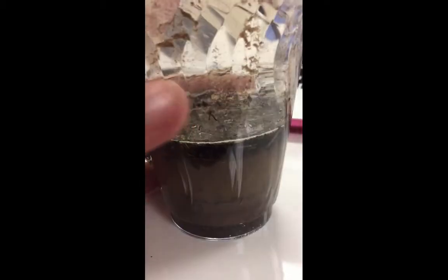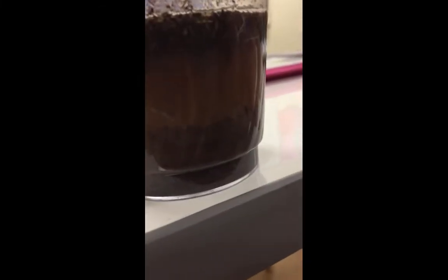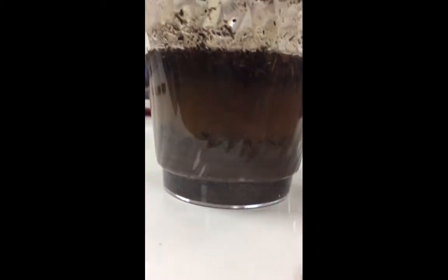The next thing we're going to do is measure the height of each layer within our cup. So in our cup we should have layers of sand, silt, and clay. In your cup you can kind of see the patterns of layers.